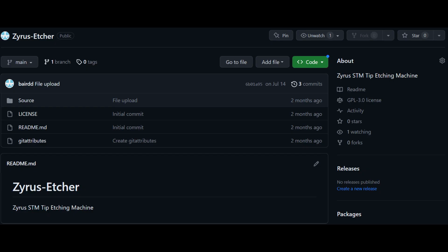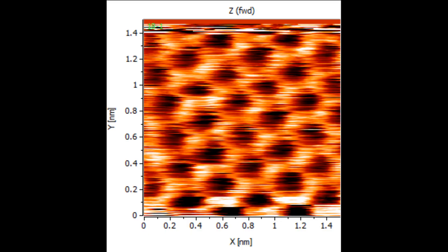Files for the etcher, including CAD and code, can be found on my GitHub page, along with detailed procedures for tip fab and preparation. At the moment, I've been doing in-situ tip preparation by scanning on gold, but the STM is still under construction and I haven't gotten good images off the system yet.